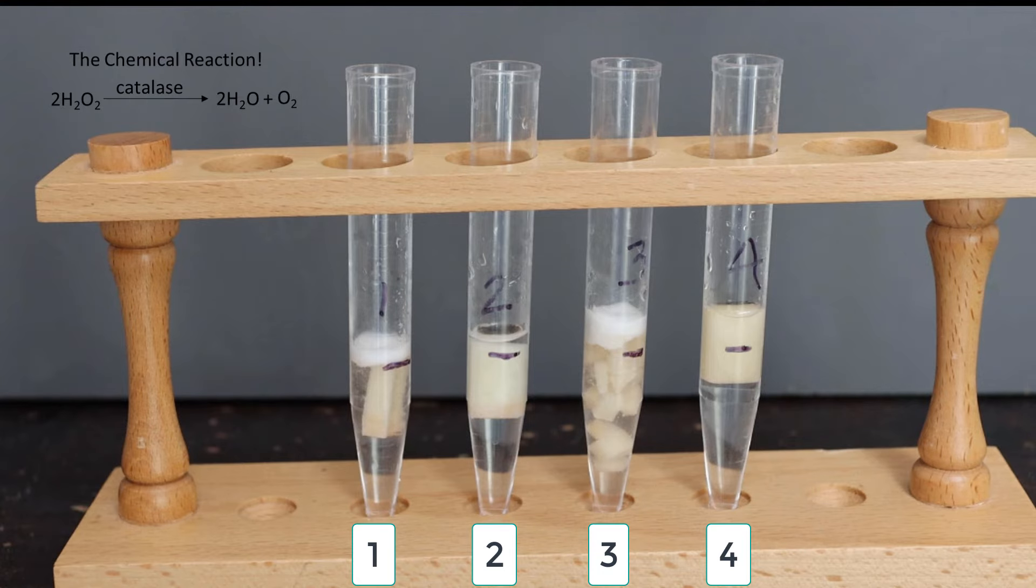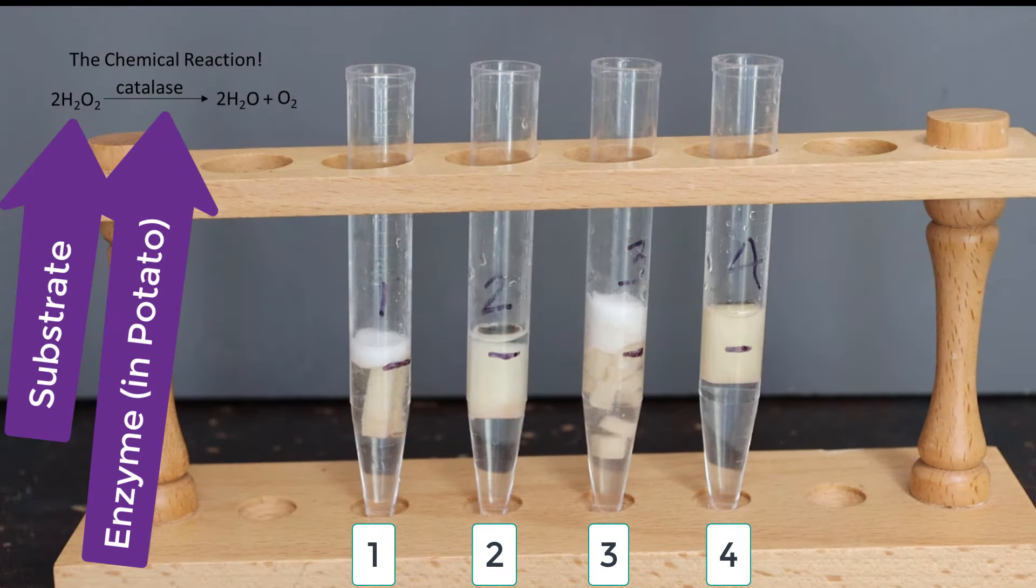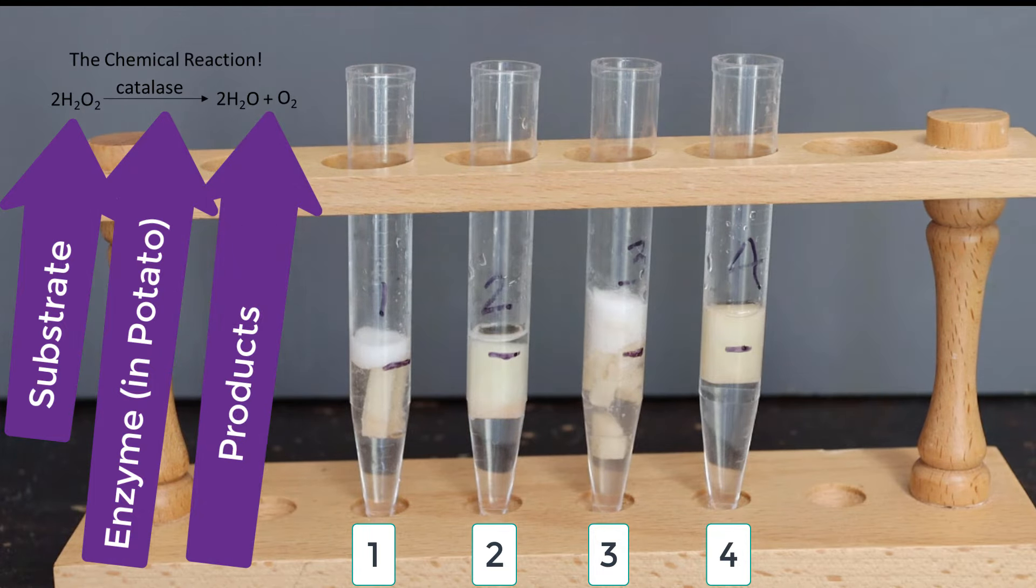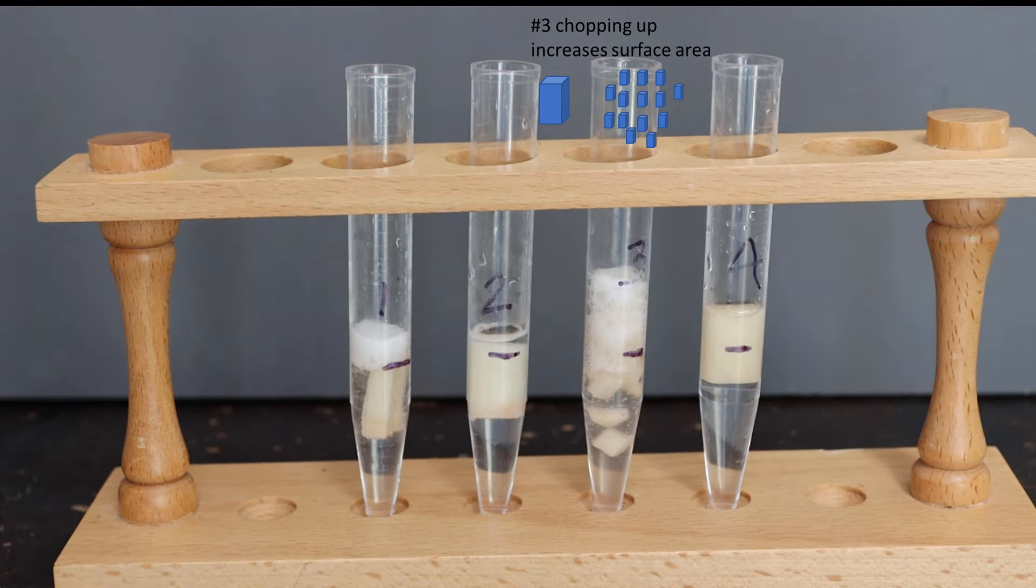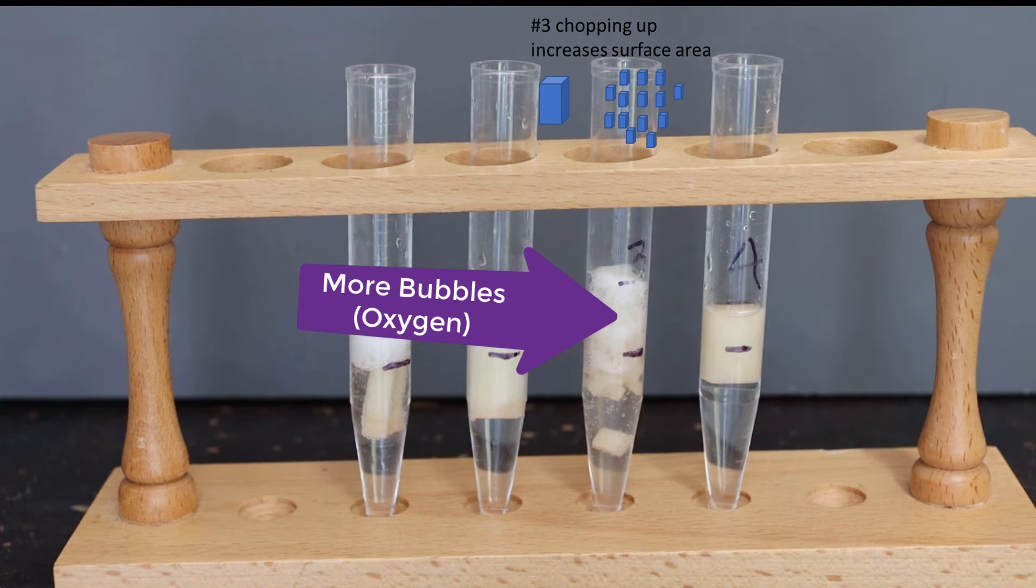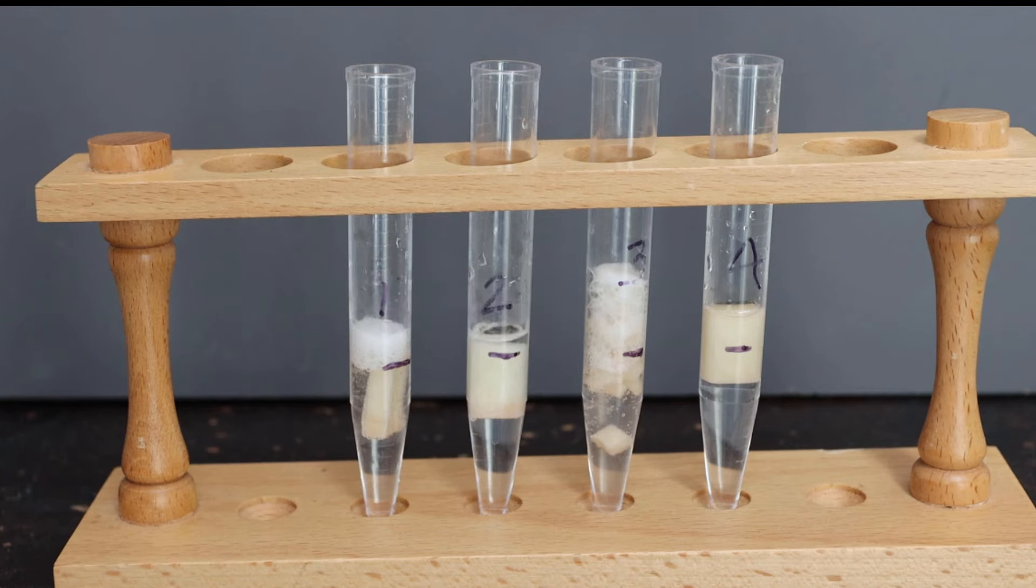Then we let them sit and what you see is the enzyme taking action and doing the chemical reaction, which is taking the hydrogen peroxide (H₂O₂) and converting it into water and oxygen. That enzyme catalase is found inside the potatoes. And you can see in test tube three that by chopping up the potato and increasing the surface area, we allowed more of the enzyme catalase to come into contact with the substrate, which is hydrogen peroxide, resulting in more bubbles.